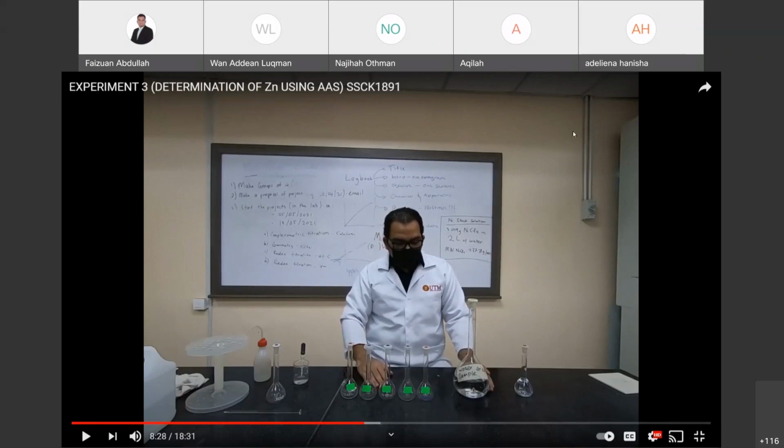I would like to ask all of you. You can see that I'm preparing a series of calibration solutions from 0.1 to 0.5 ppm.